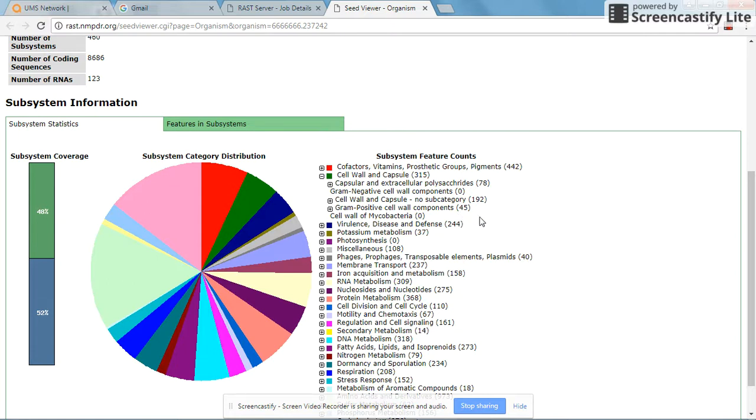Gram-negative cell wall components are zero and gram-positive cell wall components are 45. So this is definitely a gram-positive bacterium. This parameter is very useful to determine whether your genome has been contaminated with other bacterial species. If you have a contaminated genome, you will definitely have some gram-negative cell wall components.